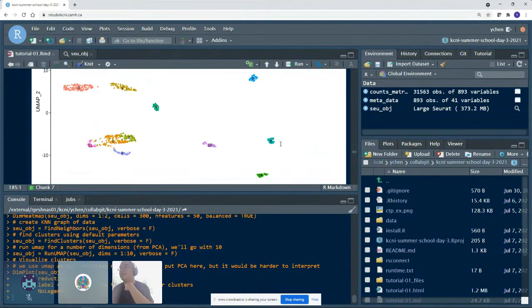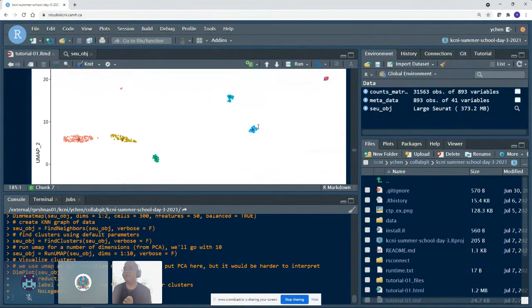These numbers are the labels that Seurat has detected for cell types and cell groups. And a big part of the work at this point, for people who are doing this de novo, from scratch, is to dig into each of these groups and say, oh, are these neurons? Are these non-neurons? What's happening here? We don't need to do that because we'll be working with the Allen Institute definitions, but that is where people typically go from there.